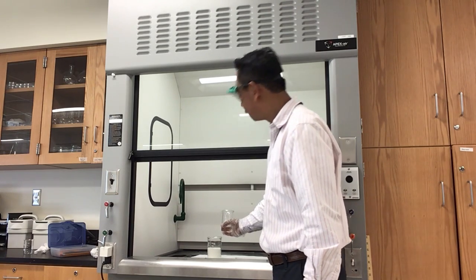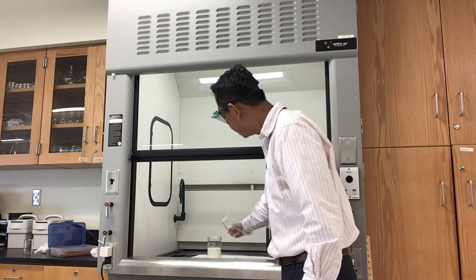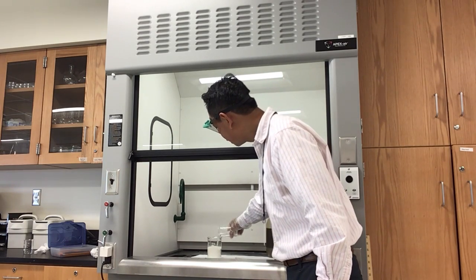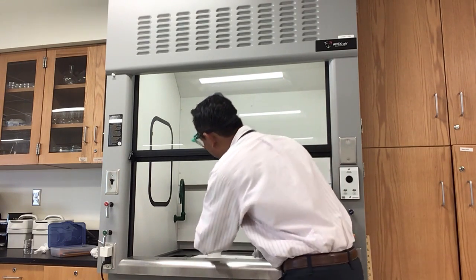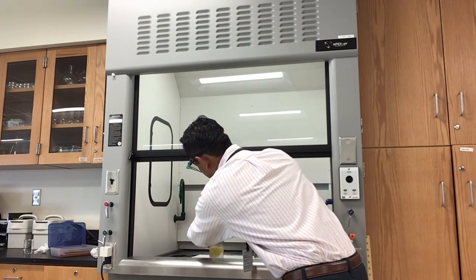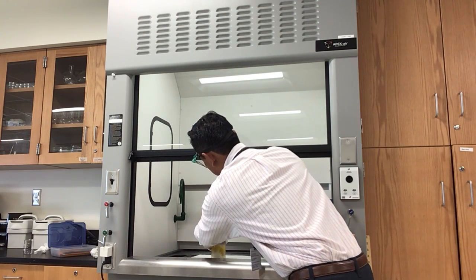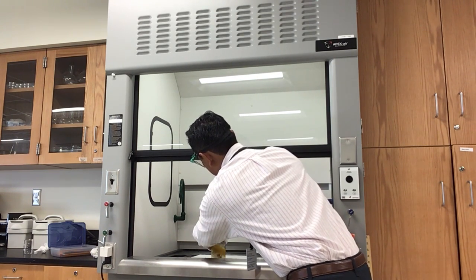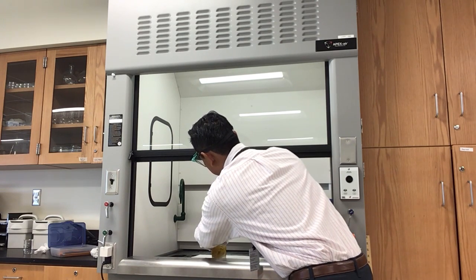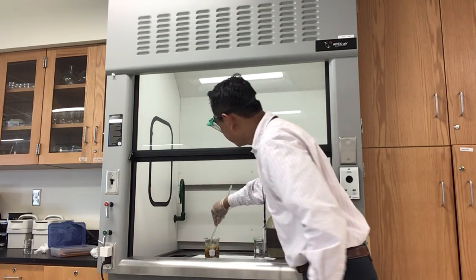I'm going to put in the sulfuric acid in here. Again, if you have this stuff, do not try this at home. Okay, I'm just going to put it in, and I'm going to stir it so that it mixes well. Stir it so it mixes very well. Okay? It's beginning to turn already.